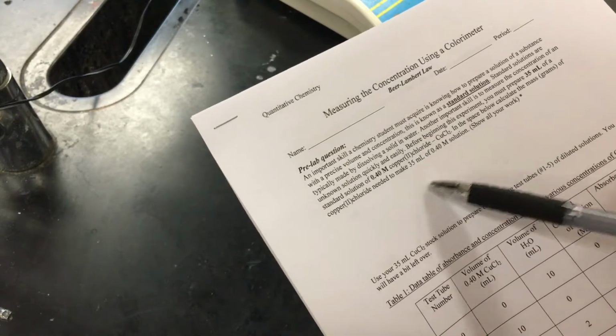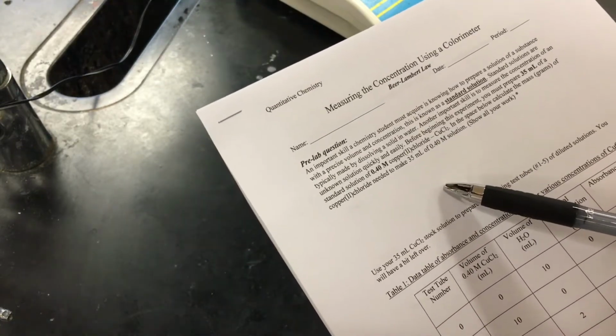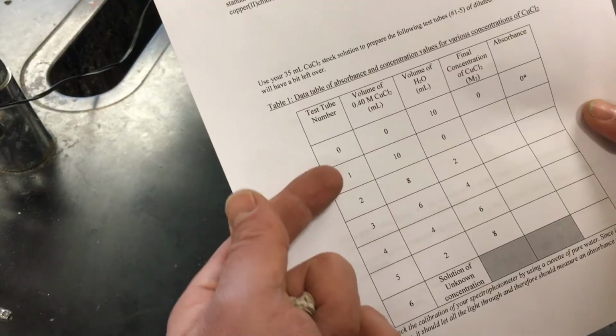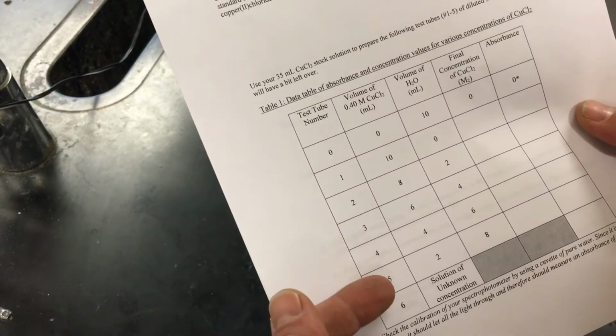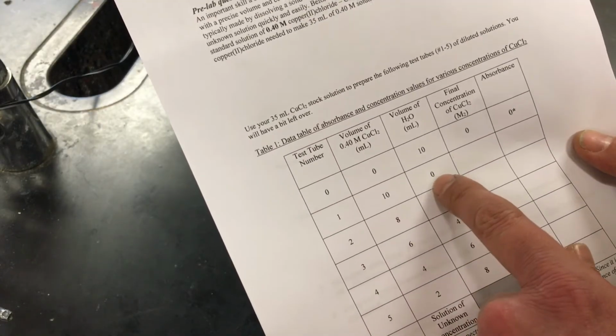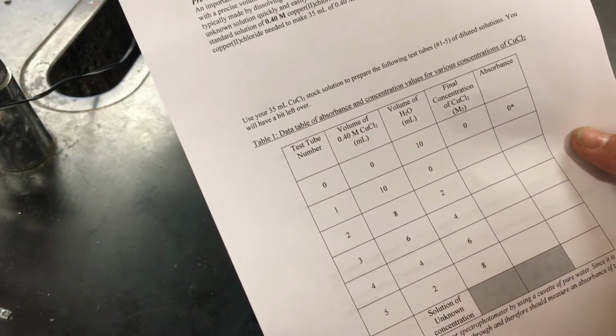And then once we have this 35 milliliters of stock solution made, we're going to prepare 5 dilutions. These test tubes, number 1 to 5, actually the first one is not a dilution, it's just 10 milliliters of our stock solution and 0 milliliters of water.